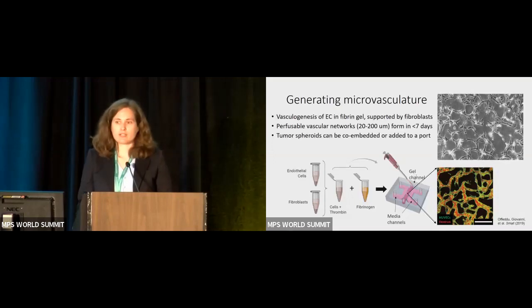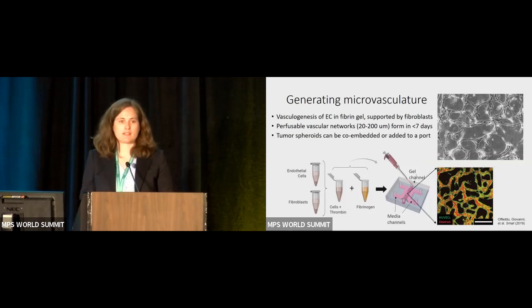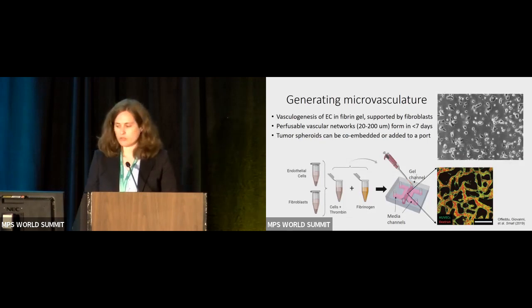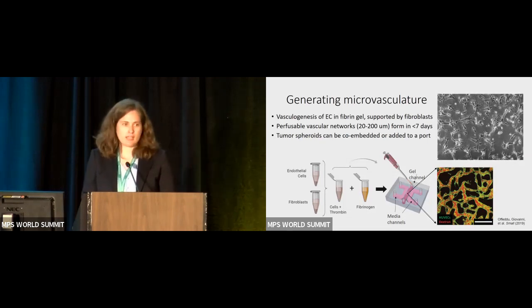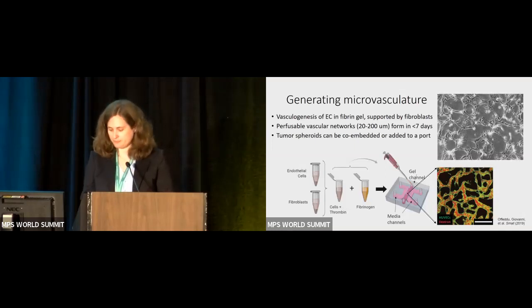So the microfluidic devices for this model are very simple. So you need a single channel for your hydrogel containing the cells. That forms the microvascular networks. And then we have 2 flanking side channels for fluid flow in order to support the culture with tissue culture media. Or once the networks become perfusible, that's how we introduce T cells and have them perfused through the system.